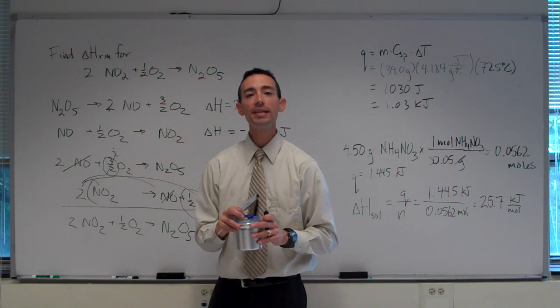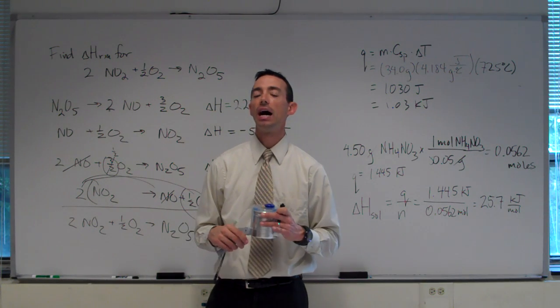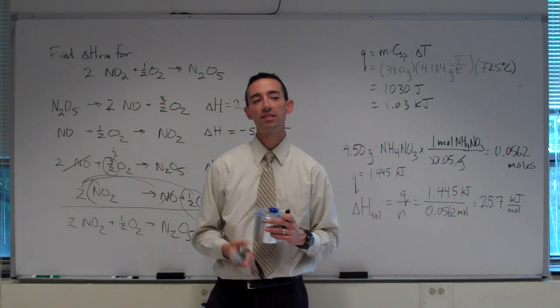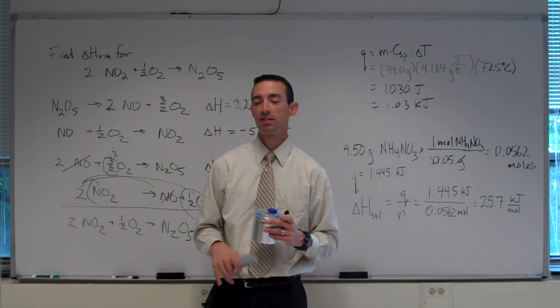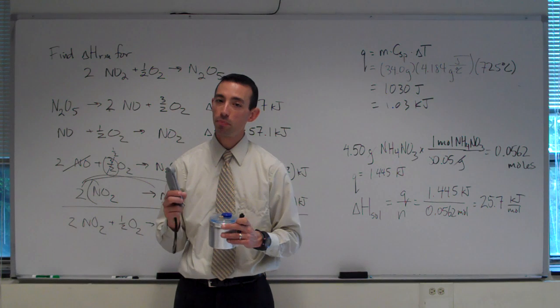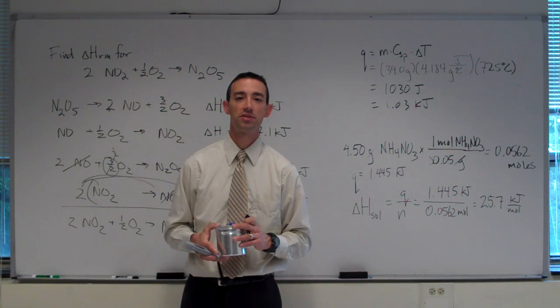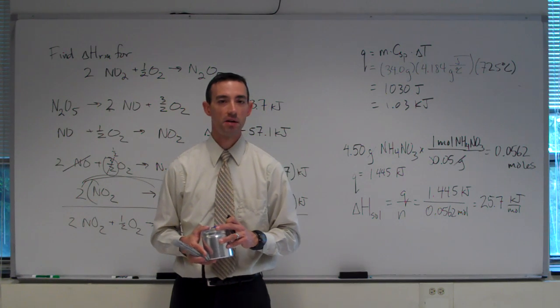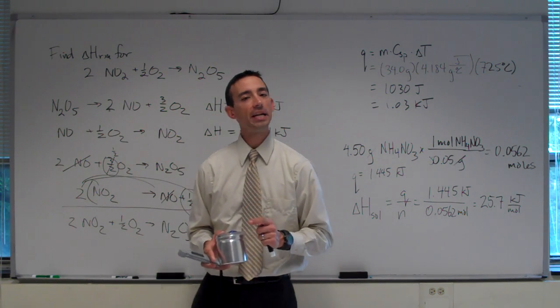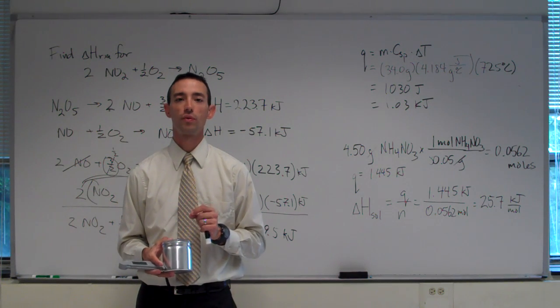Pay attention to the waste that's being generated in today's lab. It is acidic, and it does contain metal ions in some cases, or salts, I should say, of those metals. So we are not going to pour it down the drain. There are waste collection containers in the waste hood. There may be a variety of containers in those hoods, so please read the labels correctly.